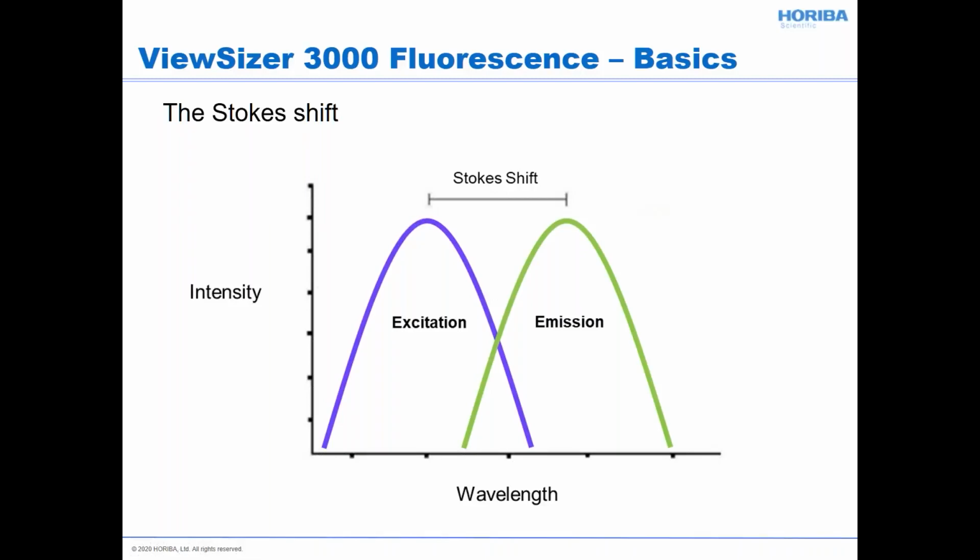So there are a couple of things about fluorescence. The first is that it's incoherent, which really makes for a miserable dynamic light scattering experience, but does not bother nanoparticle tracking because we don't rely on coherence. And the second is it lets us differentiate between particles that are fluorescent versus not fluorescent.